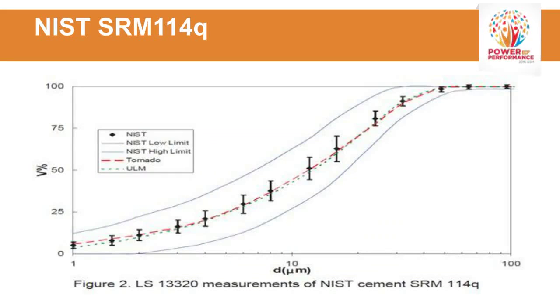And then last but not least, when analyzing real cement, utilizing the NIST SRM 114Q, the NIST values for the standard are the diamond-shaped positions, with the blue lines being the limits. Now this standard's for laser diffraction instruments, and one has to be within the blue lines to be acceptable.